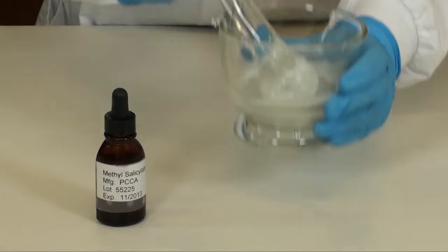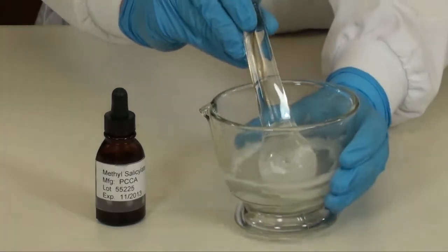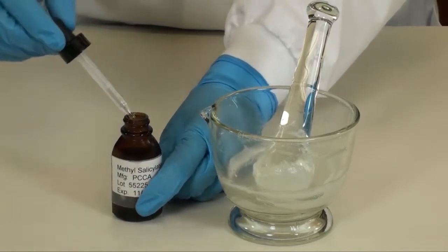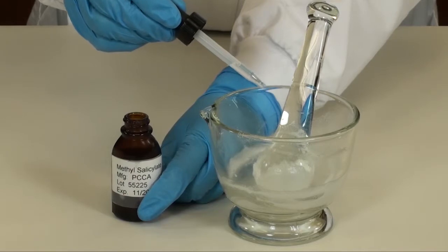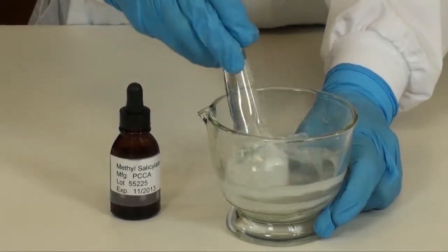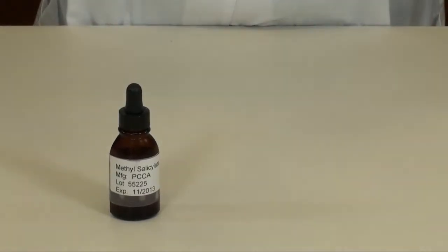Bring the mortar up to your nose and gently inhale. If the camphor smell has not been covered, go ahead and continue to add methyl salicylate up to 10 drops. Triturate after each addition and continue to smell until it's pleasant.